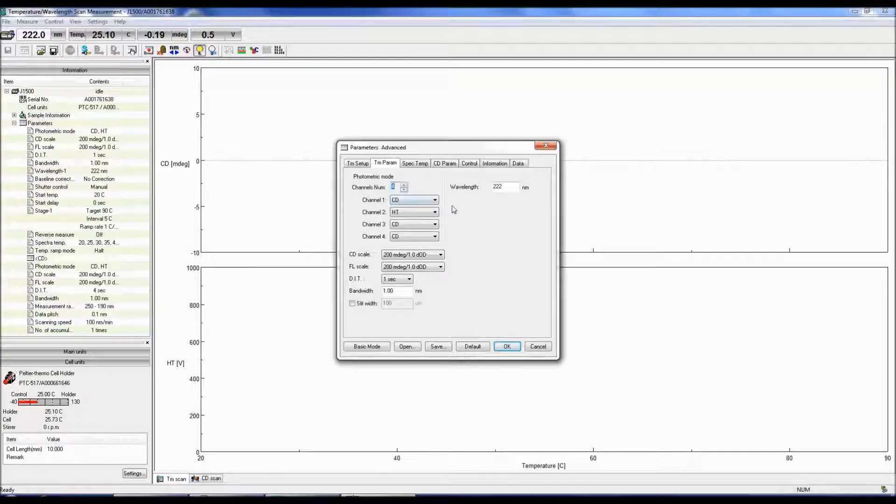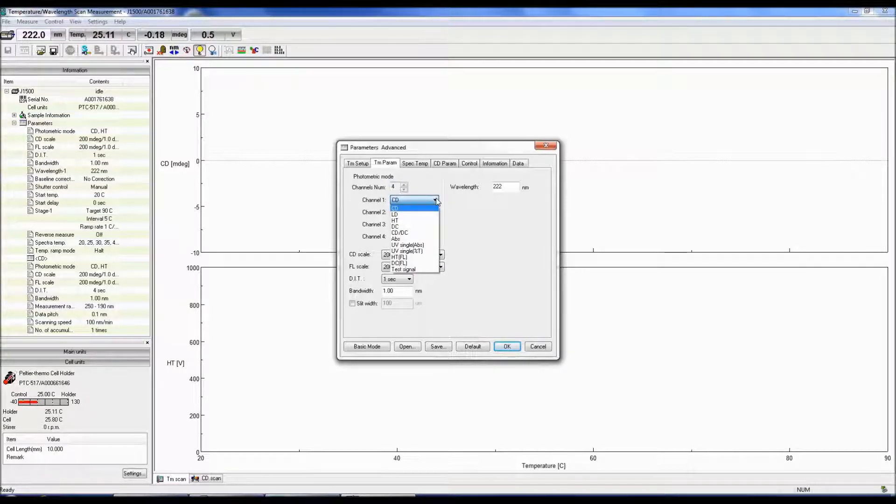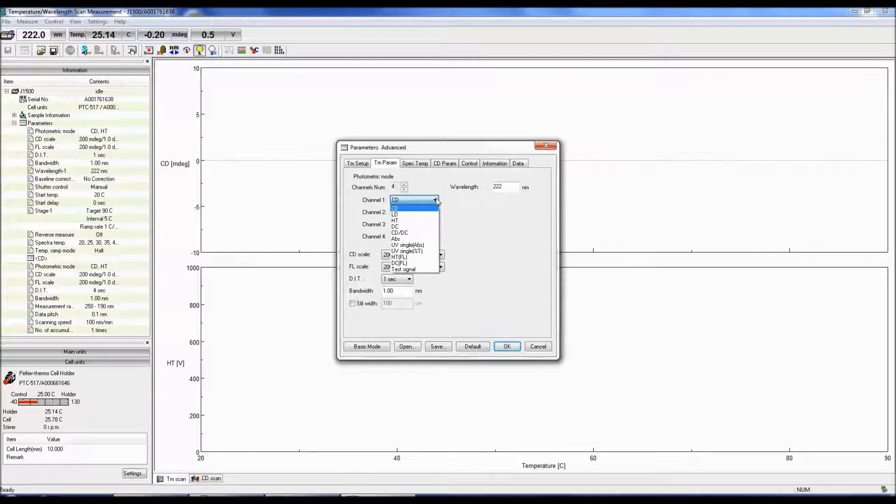CD is the circular dichroism signal. LD is the linear dichroism signal.